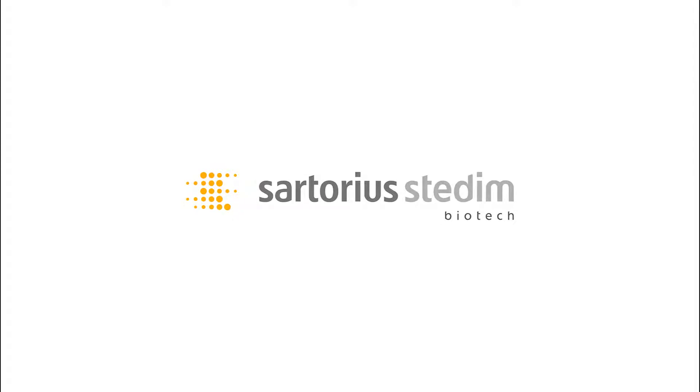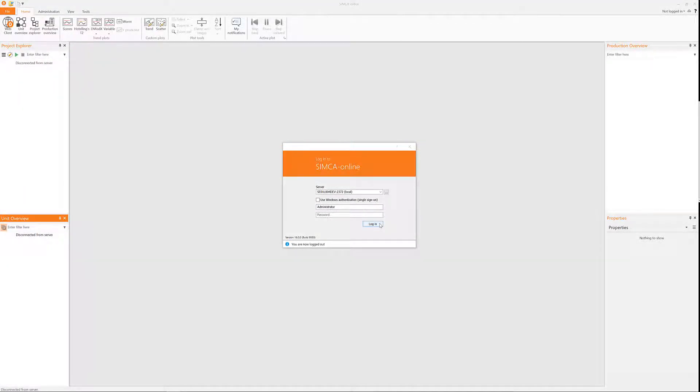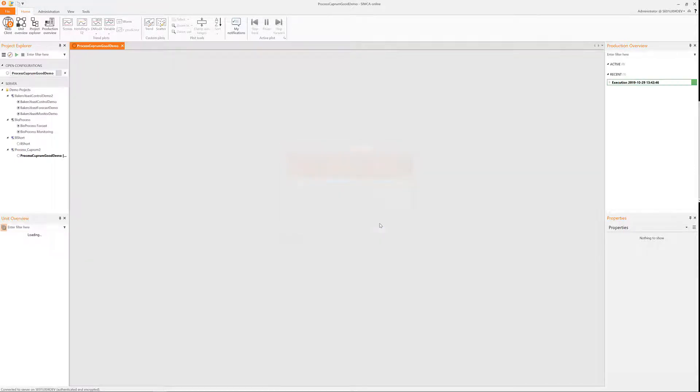Welcome to the general video on how to use the desktop client of Umetrics Suite SIMCA-online, where I will talk about the general layout of the left side panes in the system. Let's start by logging in and for this video I will be the administrator user and role.